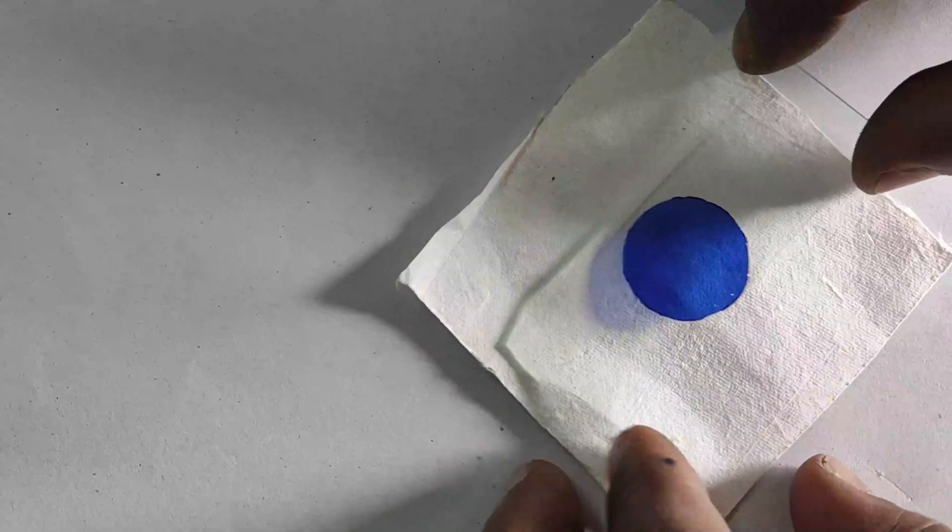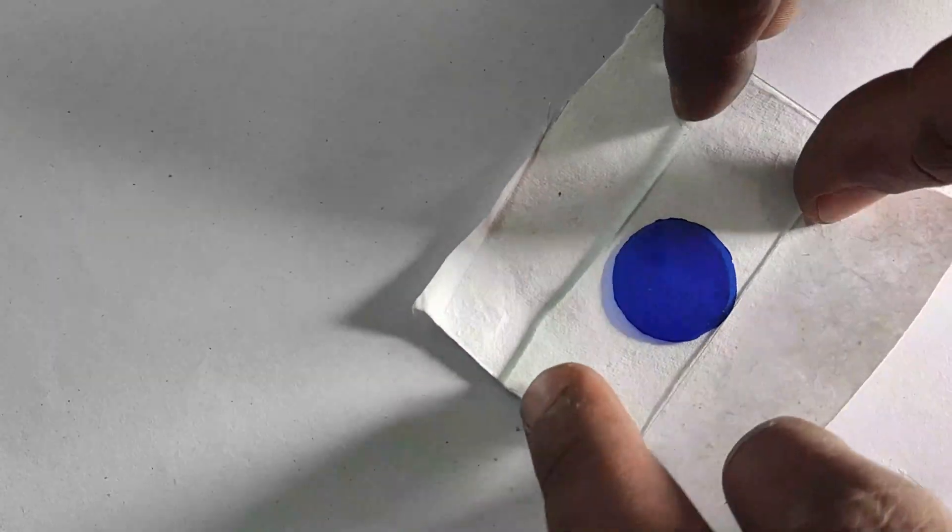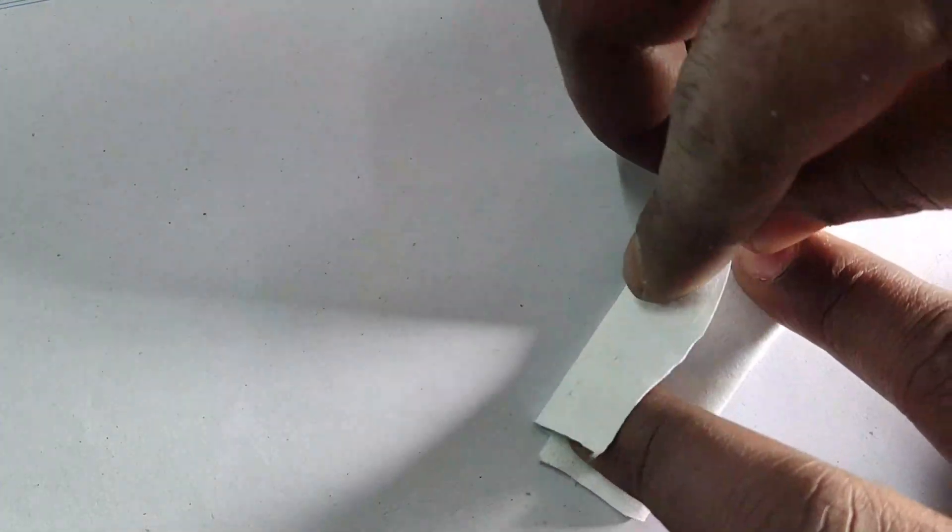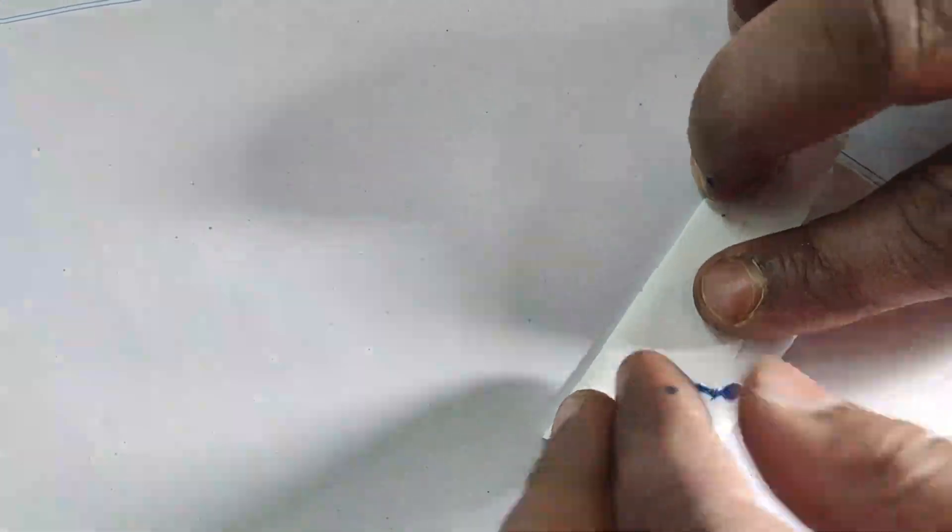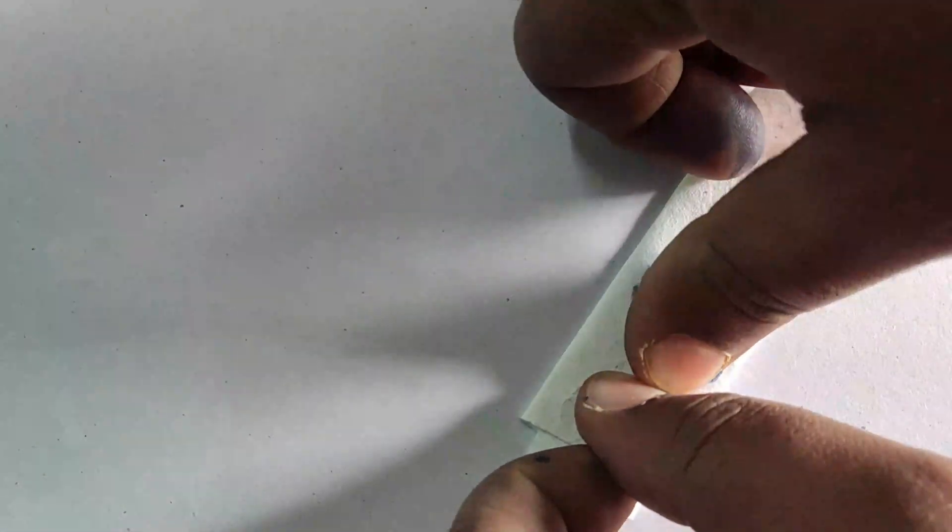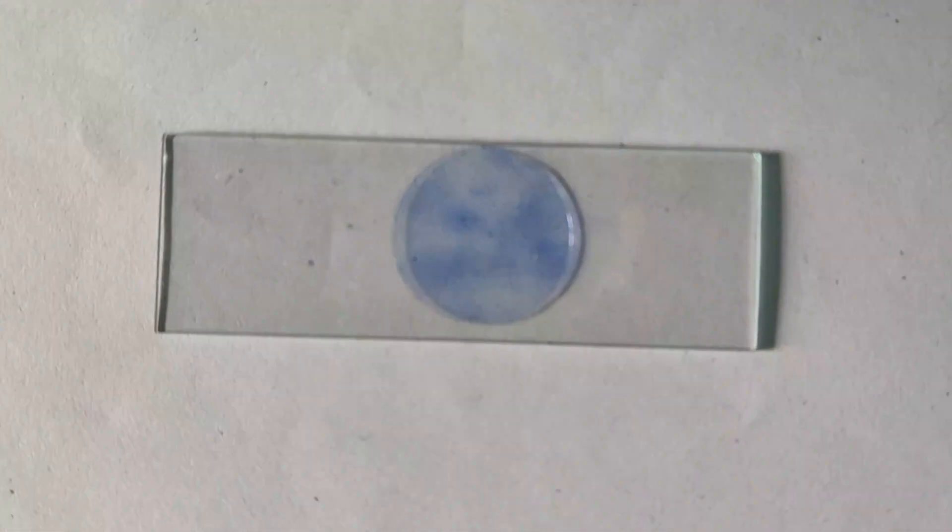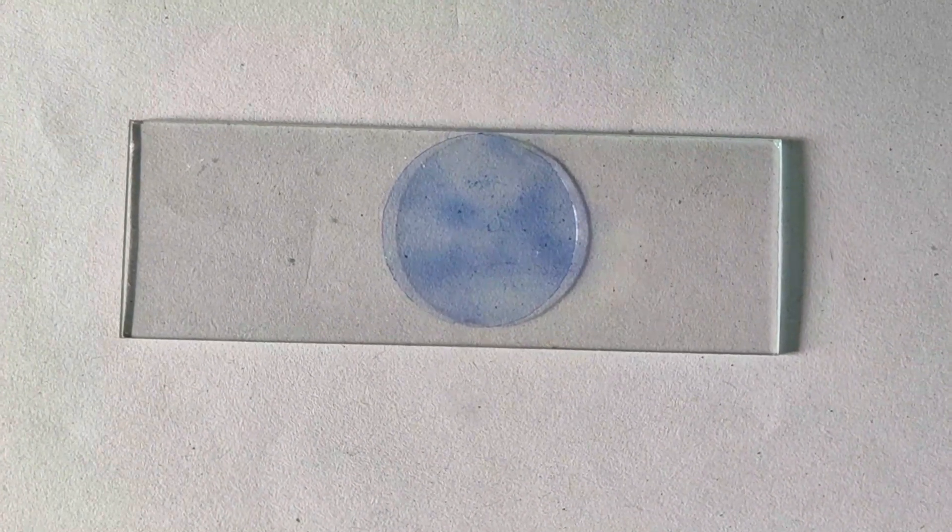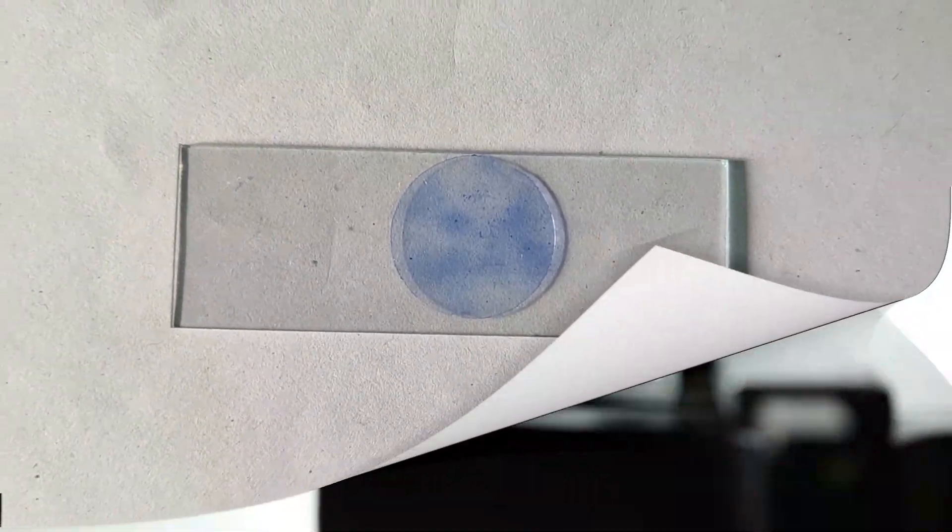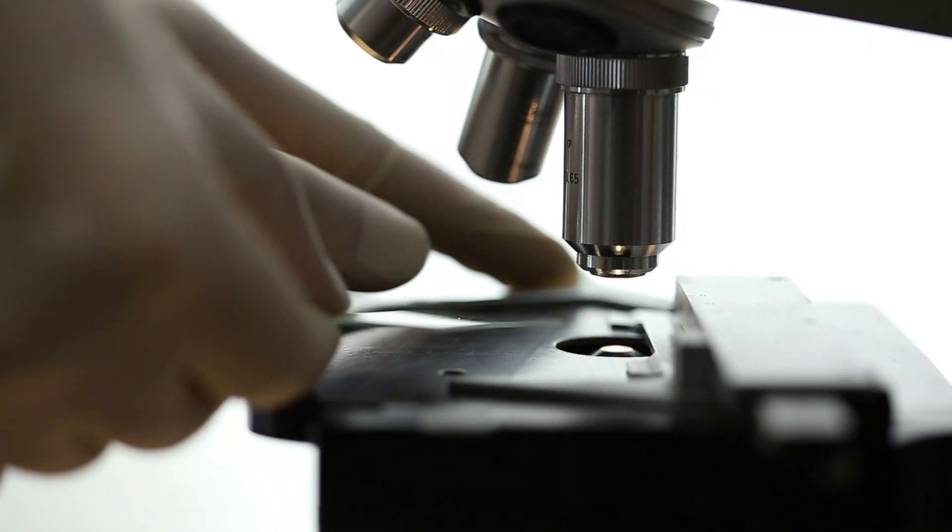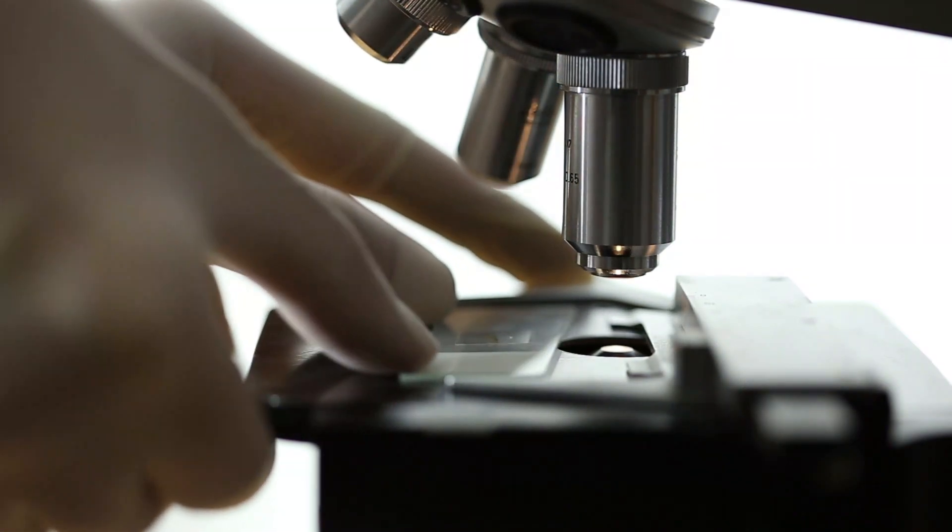After that we will discard the extra stain by using absorbent paper. First we will observe it under the low power microscope.